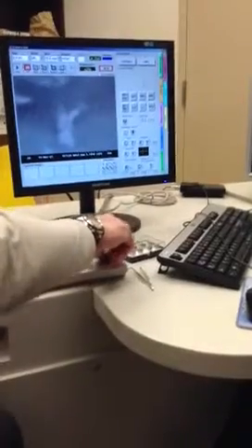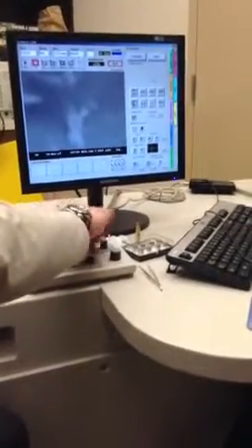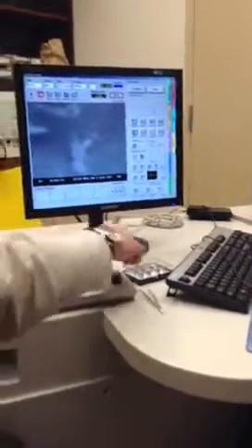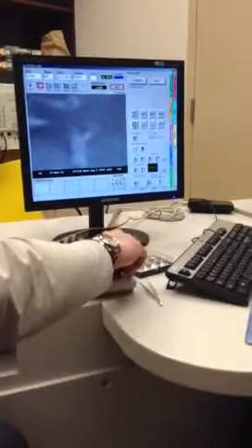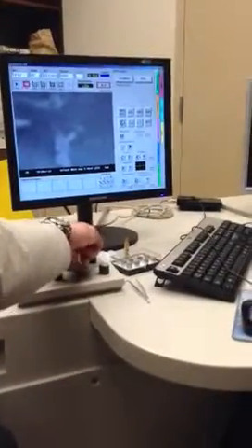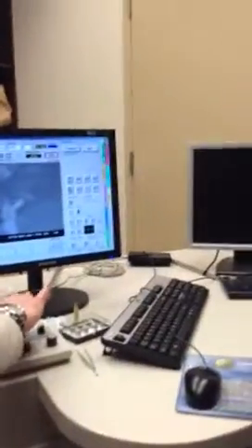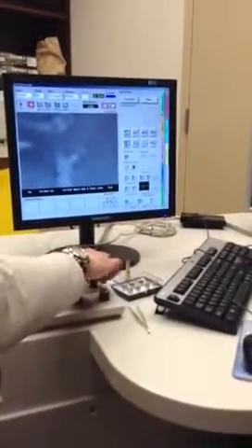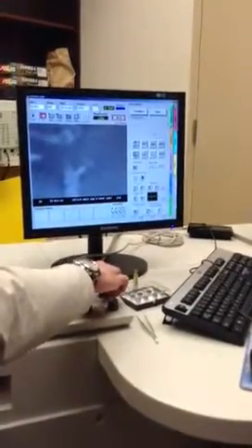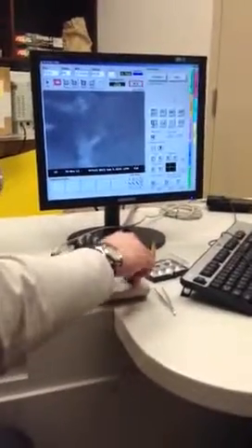So we have these two knobs here that are called stigmators, and if you focus the image as best as you can, and then adjust stigmators, you can usually improve the image if you keep going back and forth between focus and stigmator. And I usually just adjust one at a time. It's easier to keep track of. So it's not a lot better, but it's slightly clearer than it was before. And this is a little bit better defined here.